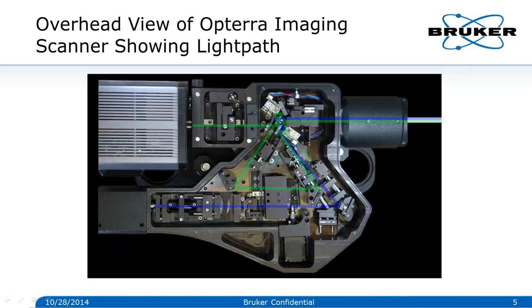Light then reflects off some optics and passes out to a galvanometer. It has a reflective surface on both sides. So on the excitation path, the light reflects off the galvanometer, and then off a mirror on a piezo, which then reflects out to the microscope.